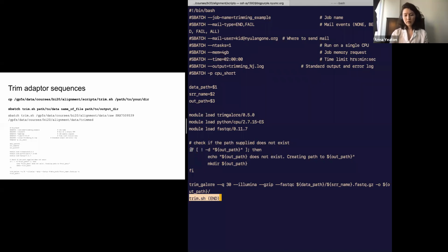So let's walk through this. We're saying if the thing within these brackets is true, then do these two lines, and then you basically finish and keep going with the script. If it's not true, then you don't even go within here.